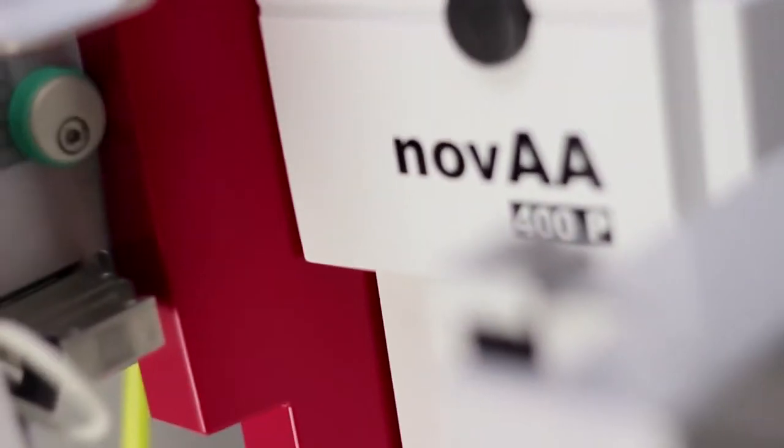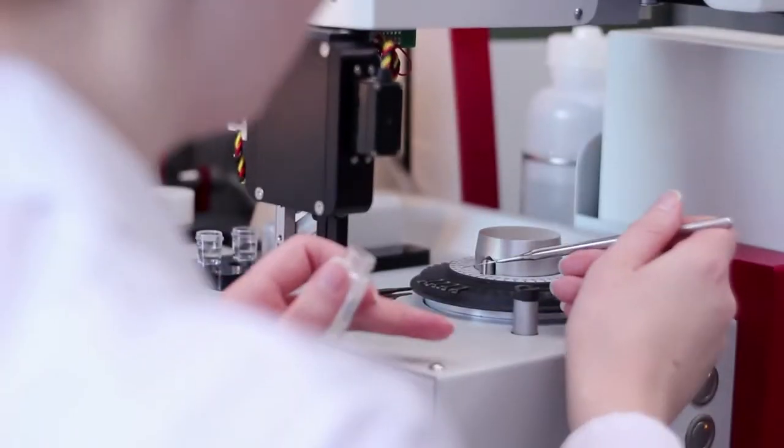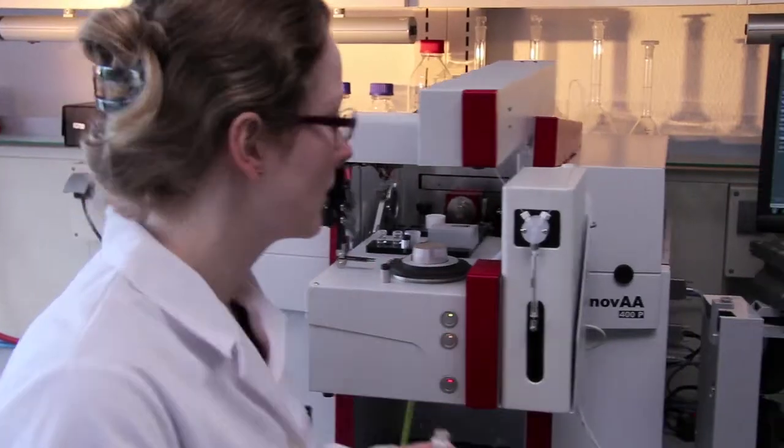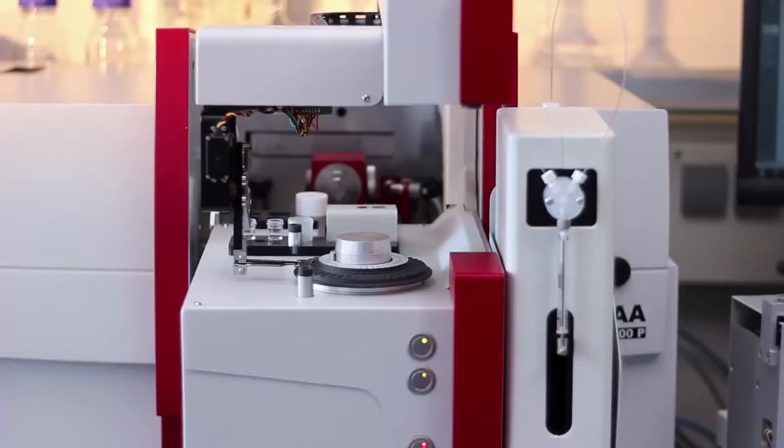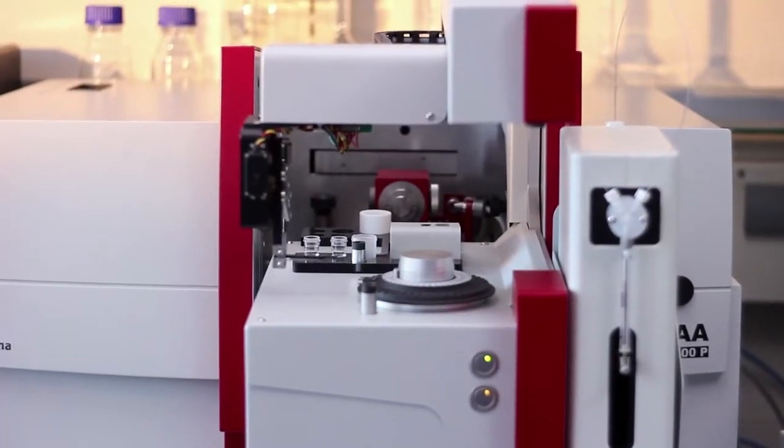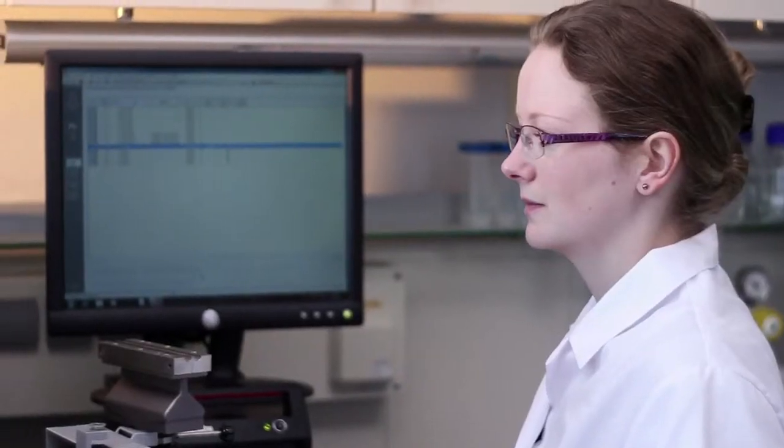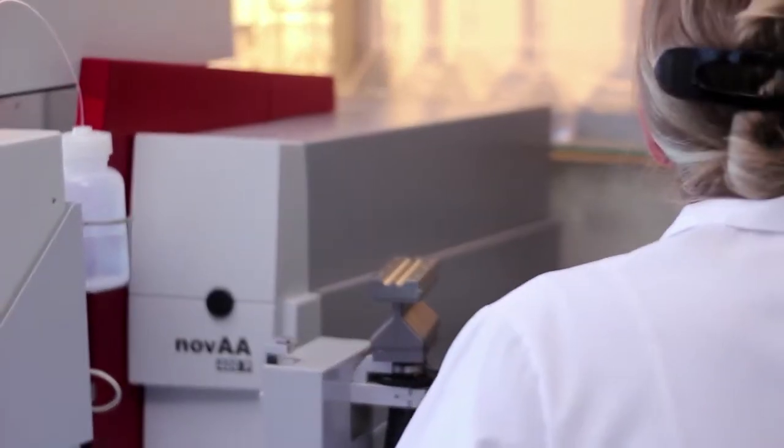Combined with a solid AA autosampler, solid samples can be analyzed directly in the graphite furnace without any preparation. At any time, our experienced application specialists support you with method optimization and help you to get the best performance for your laboratory.